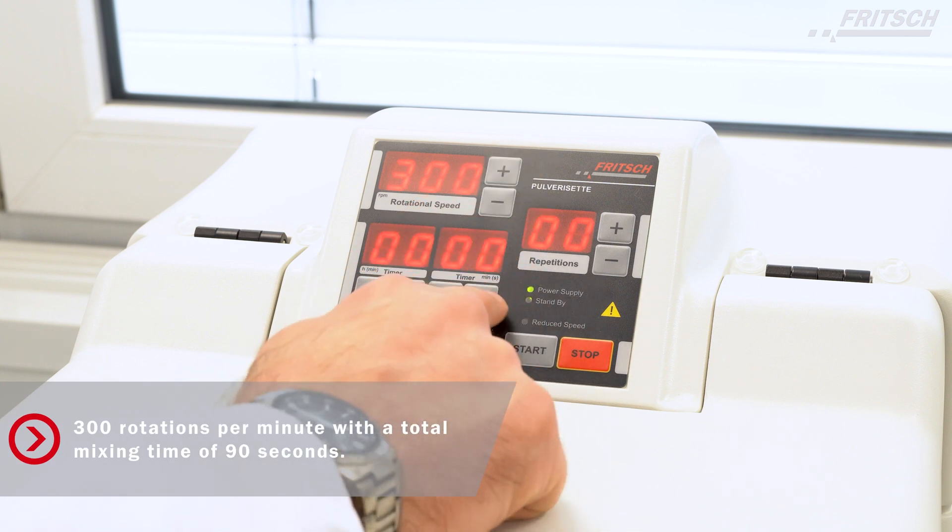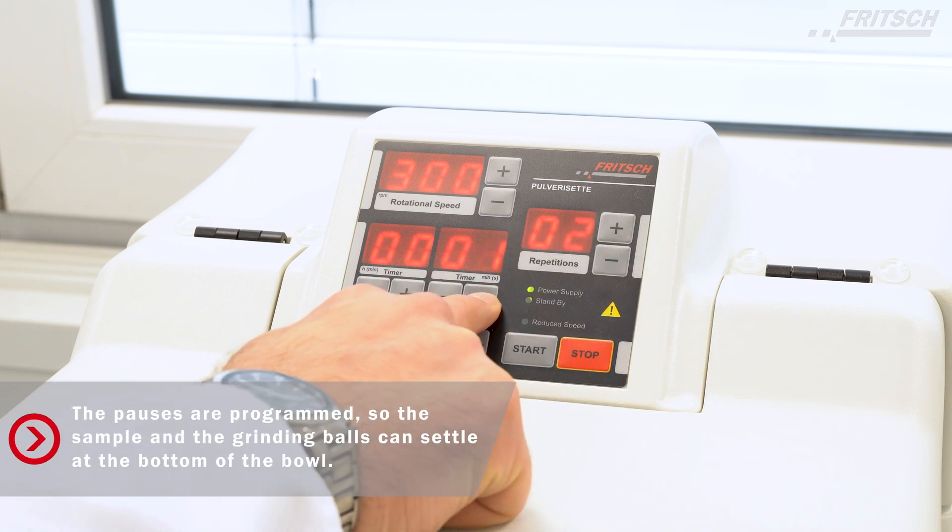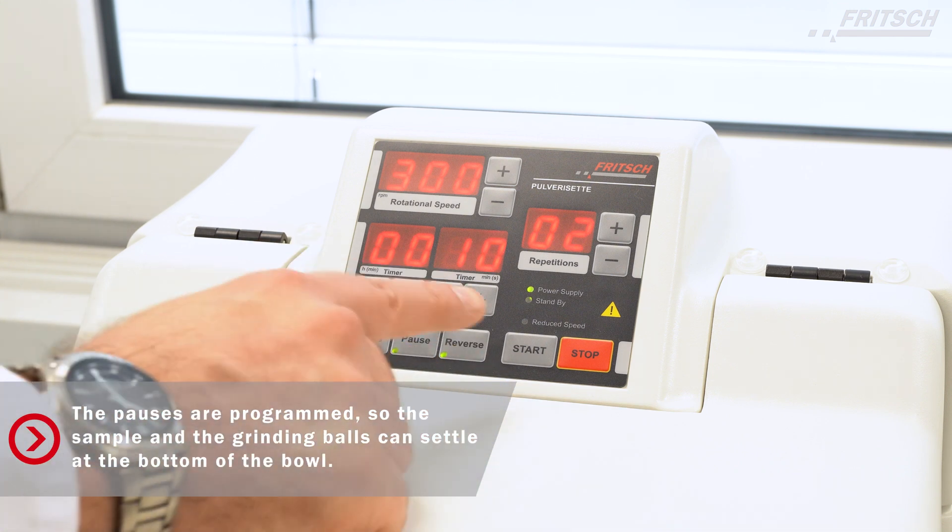The instrument is set to run with 300 rotations per minute for 30 seconds with two repetitions. In between those repetitions are 10-second pauses, so the sample and the grinding balls can settle at the bottom of the bowl.